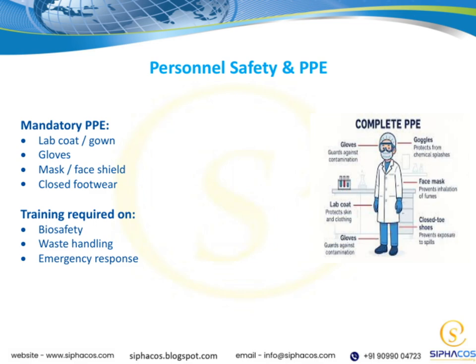Now, beyond just wearing the right gear, proper training is equally important. You need to be trained in biosafety procedures to understand how to handle biological materials safely. Waste handling training is vital too, so you know how to dispose of materials properly without risking contamination or exposure. And of course, emergency response training prepares you to act quickly and effectively if something goes wrong, minimizing risks and ensuring safety for everyone.